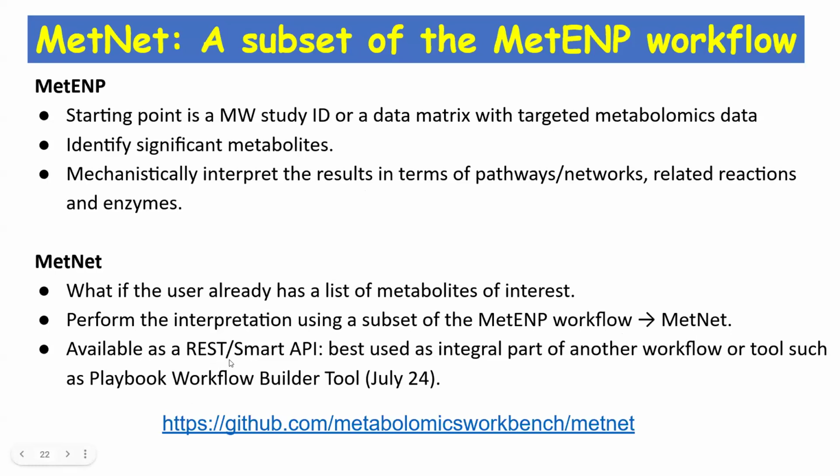So MetNet is available as a REST API or smart API. However, it is actually best used as an integral part of another workflow or tool, such as the Playbook Workflow Builder tool, which I will go into in more detail tomorrow.